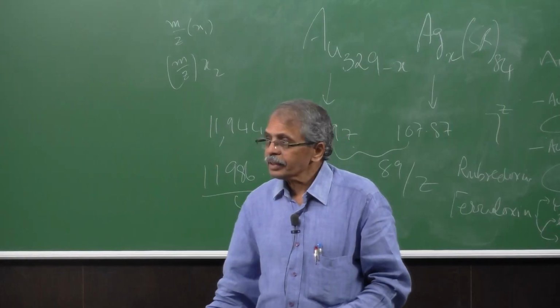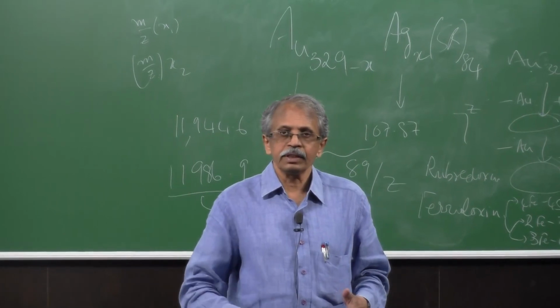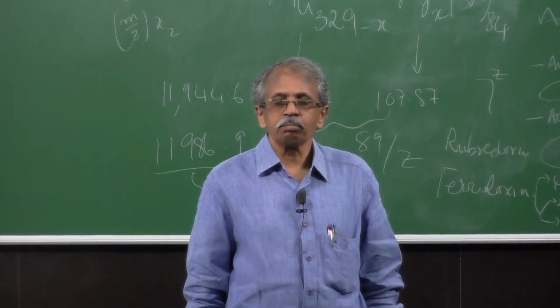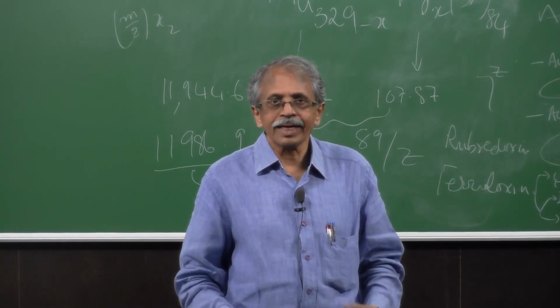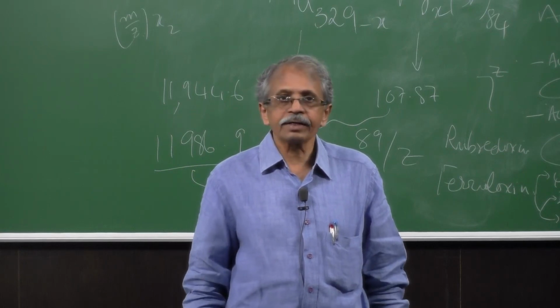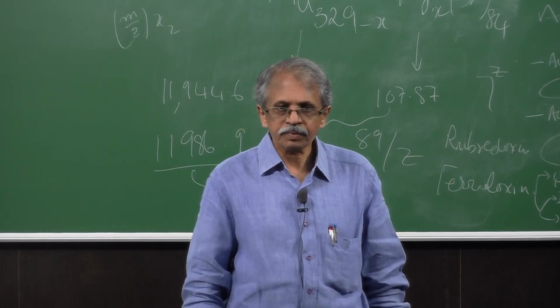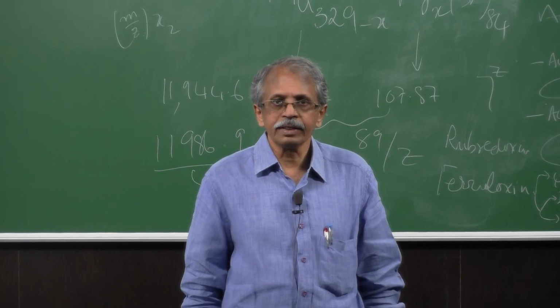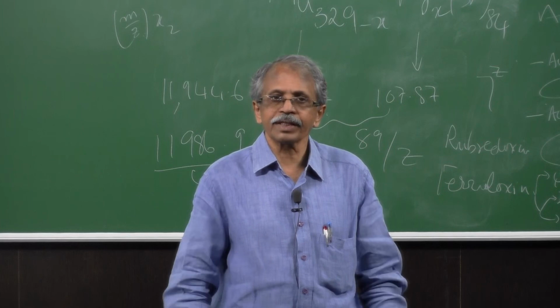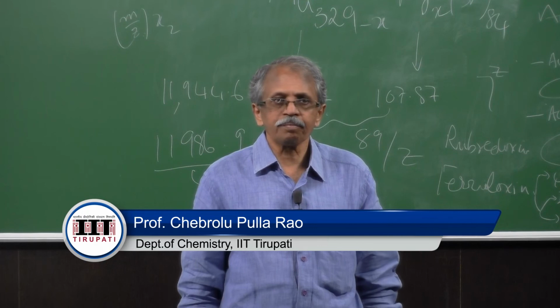Okay. So in the previous class and this class together, we have looked at mass spectrometry in depth, the electrospray ionization technique, for coordination complexes, nanoclusters, nanocomposites, proteins, and metalloproteins, and how to determine the molecular weight from these. In the next 1 or 2 classes, we will be looking at the MALDI technique and how it can be utilized for such studies.